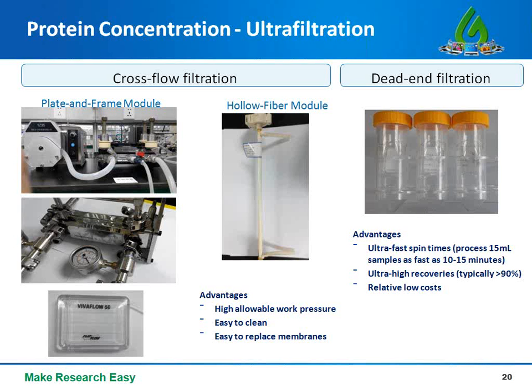Protein concentration is near the end of the protein purification process. I received a few inquiries from customers who lost their proteins in the concentration step. Surely, you don't want this happening as you are almost there to obtain your purified protein.